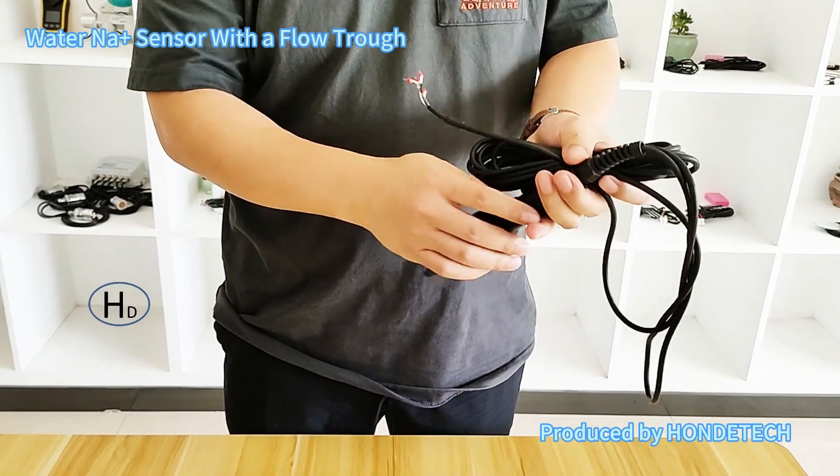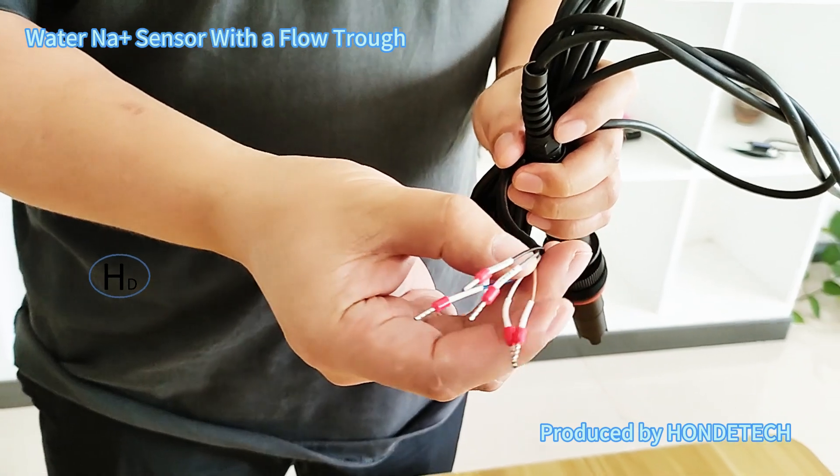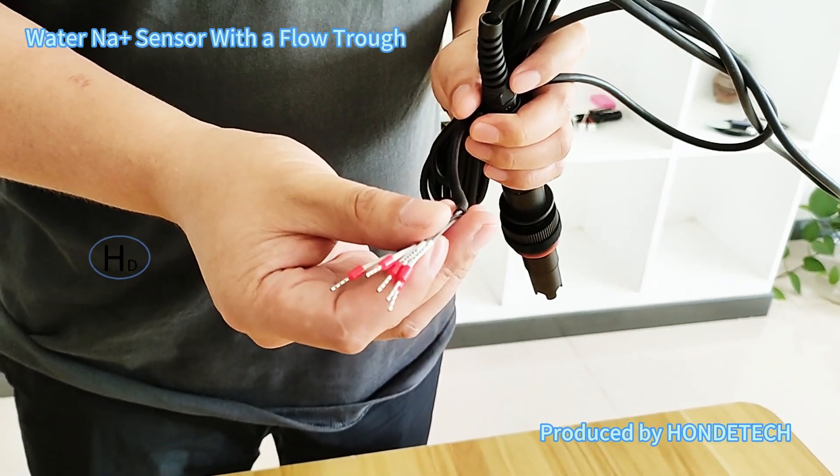For the output, it supports RS485 output and also the 4-20mA output.